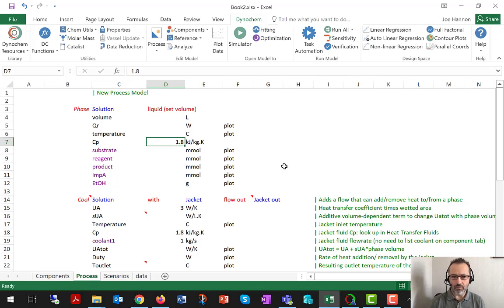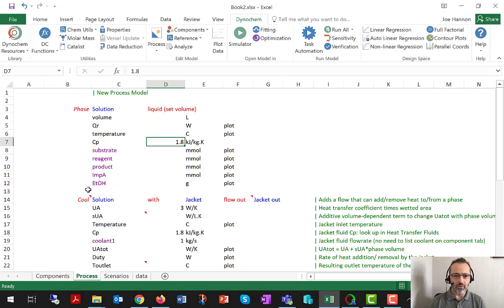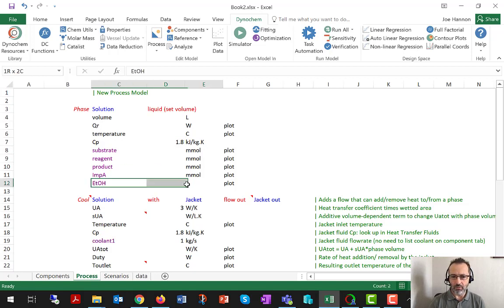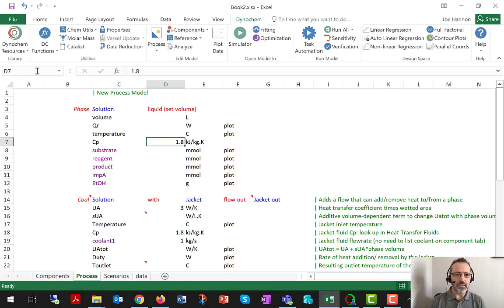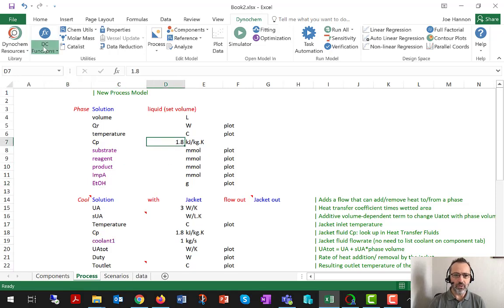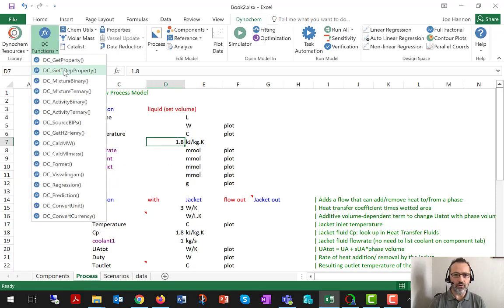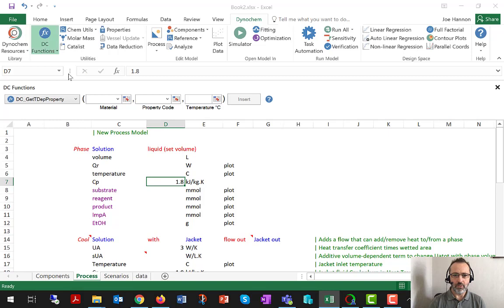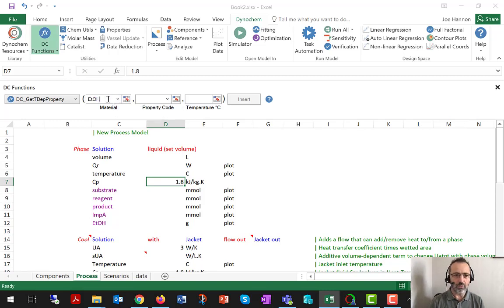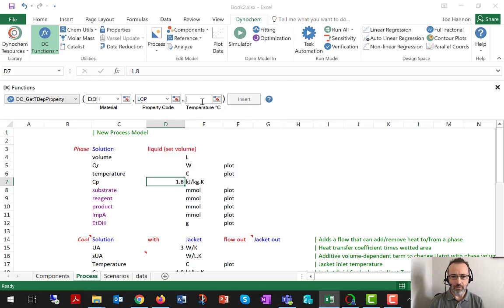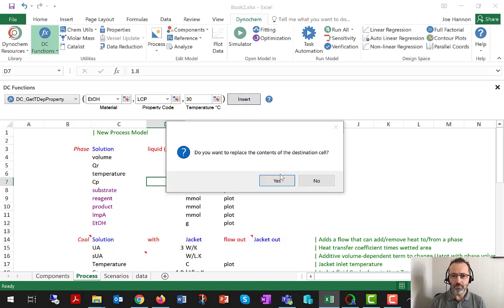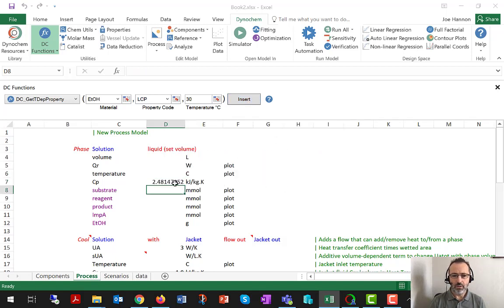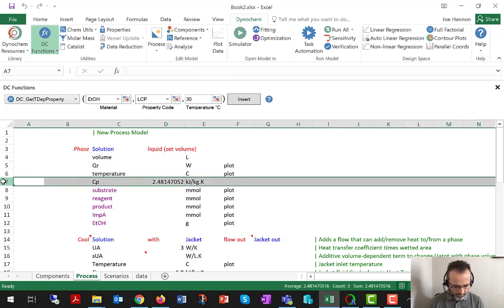And now I need a CP value for the solution phase. Ideally, that would come from an experimental measurement like in the RC1 or similar instrumentation. However, because the dominant material here is ethanol, it's probably quite a good assumption that the CP is dominated by ethanol's CP. So I'm going to use DC functions here to quickly retrieve the correct CP. Type the name of the component, ethanol, choose the property CP, choose the reaction temperature, 30 degrees C, accept the prompt. And now I have an accurate value for CP in the solution phase.